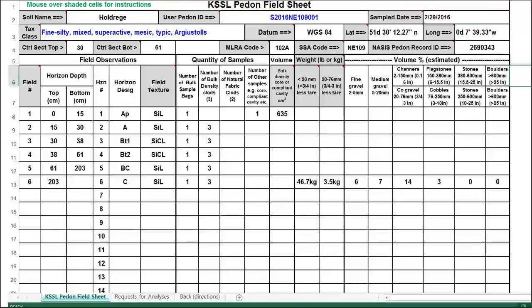And then a follow-up, they're wondering, should it read water content is determined in the lab, so seal the bag well? We always suggest you staple them shut. It isn't perfect, and the stapling certainly is not sufficient to hold against free water in the bag. If you do have a wet soil or soil with free water, if you'll let that bag set for 30 minutes or so and decant that off before you staple it, that'll go a long way. So if you can decant off any free water, that's helpful.